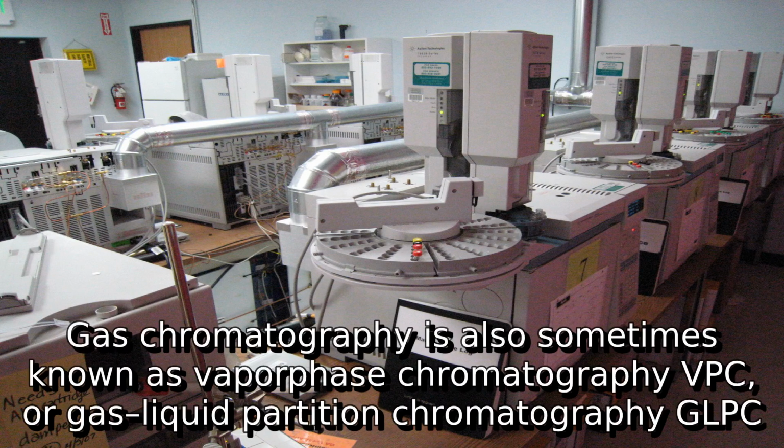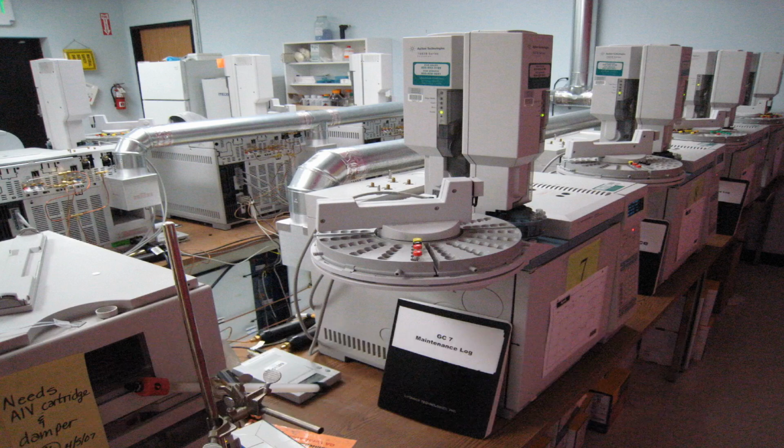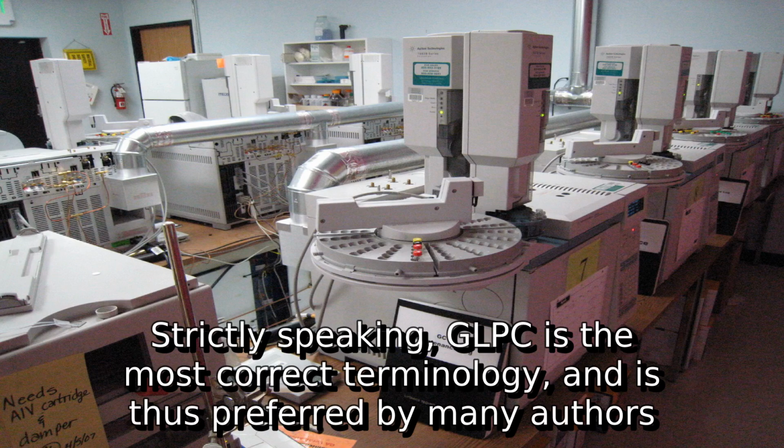Gas chromatography is also sometimes known as vapor phase chromatography (VPC) or gas-liquid partition chromatography (GLPC). These alternative names, as well as their respective abbreviations, are frequently used in scientific literature. Strictly speaking, GLPC is the most correct terminology, and is thus preferred by many authors.